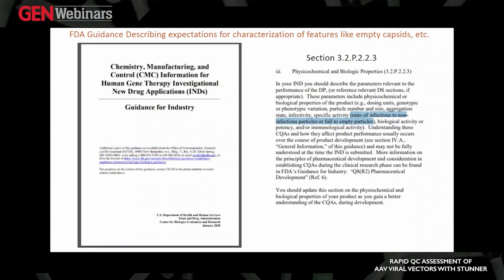I made an earlier reference to an FDA advisory meeting that was held in September last year. And this was a meeting that was dedicated to understanding the toxicology risk from an AAV vector. And this percent full empty ratio was the most prevalent CQA that was discussed. And this is very timely. It's timely to have this meeting because with the clinical successes we are seeing with AAV and the rapidly growing number of clinical investigations we are seeing, AAV therapies will undoubtedly move from rare disease indications to larger common disease indications. So it is important to have these discussions and data now.